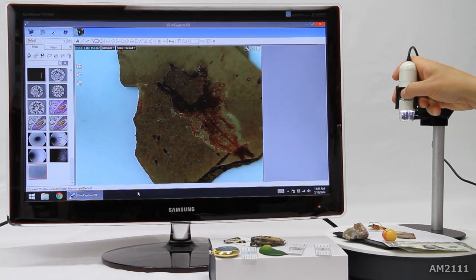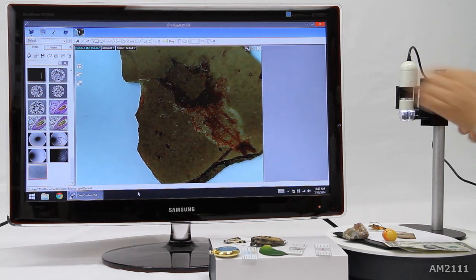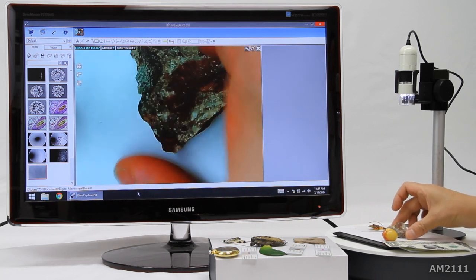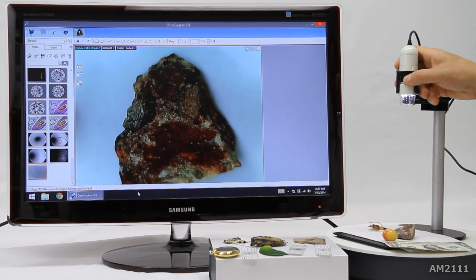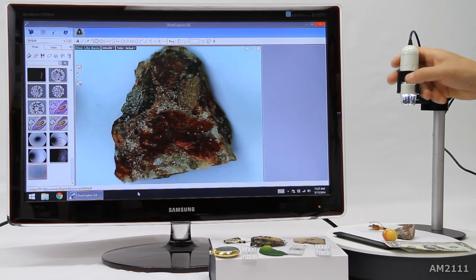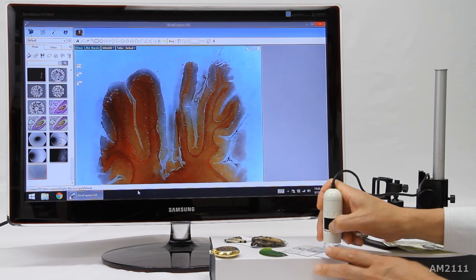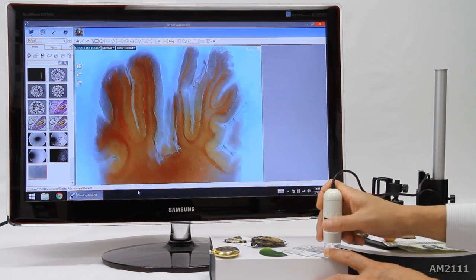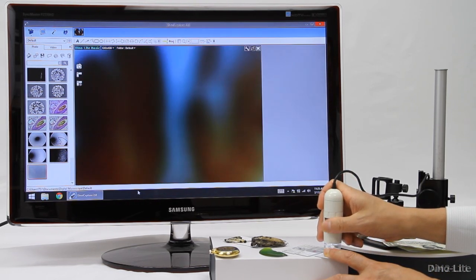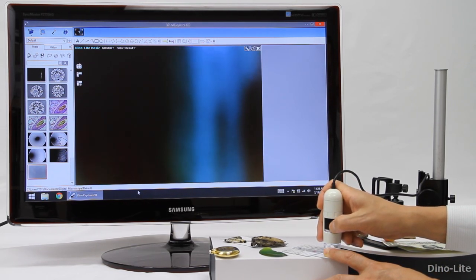The AM2111 has a resolution of 640x480. You can also use the AM2111 to view slides, here shown viewing while handheld.